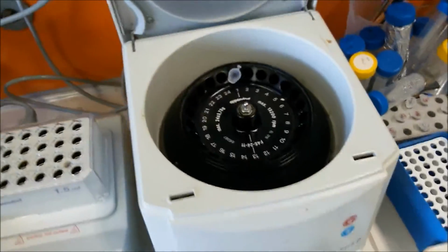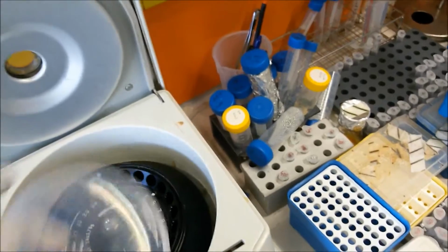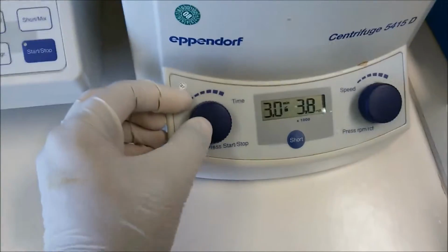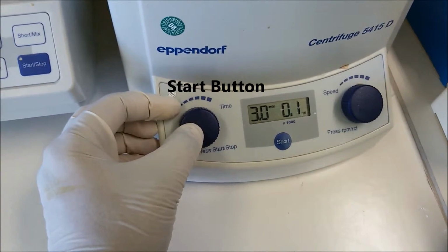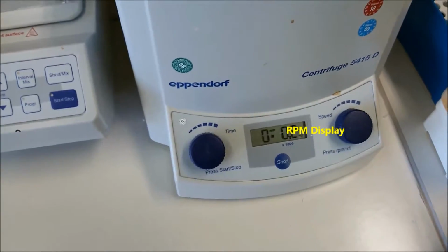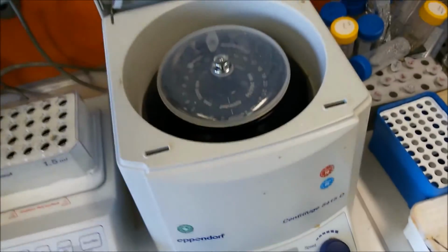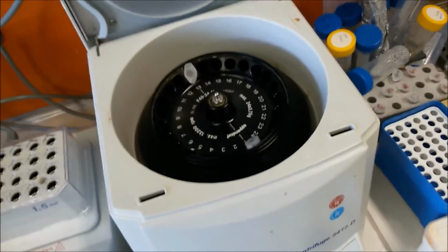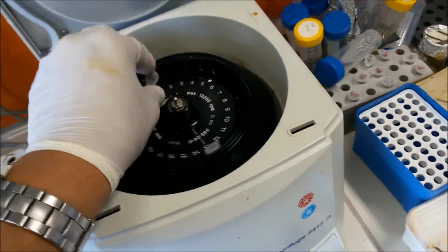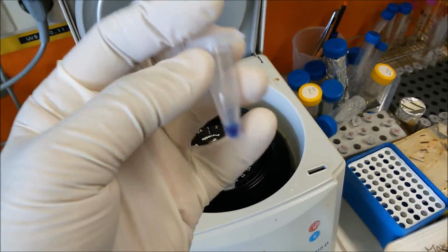So you put one tube, you put one balance tube to do this. You close it, and then we press start. We press stop. It's just like 1 second start, stop. We just want to recover our chemical, and then let's see. Oh, this is our balance tube. We don't need it. There's our sample, and now you can see whatever is sticking upside is now everything is collected here.